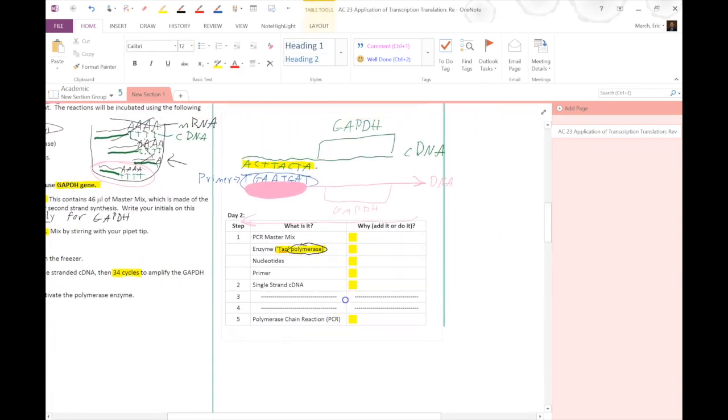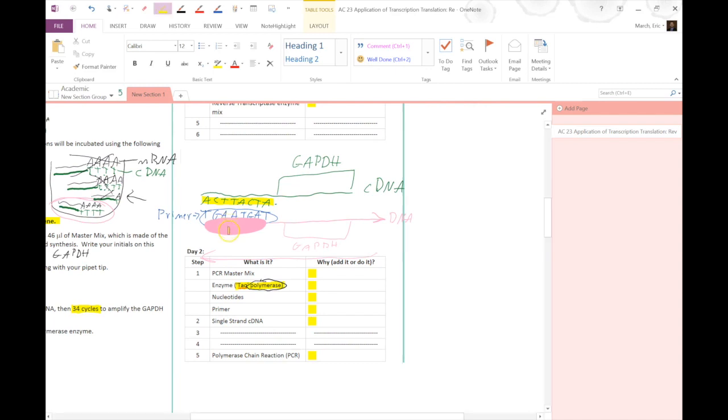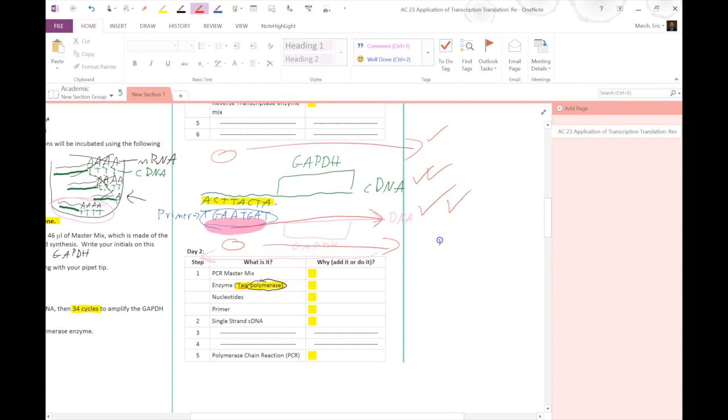So what happens is every time we run a new cycle, this Taq polymerase will run down here and make another copy of DNA. But now we've got 2 strands that we can copy. The Taq polymerase will now jump on 1, jump on 2, and make 2 copies. So now we have 1, 2, 3, 4 copies of our gene sequence. And Taq polymerase can use all 4 of those as a template. So very, very quickly we will have exponential growth going on. We will have exponential copying of DNA.